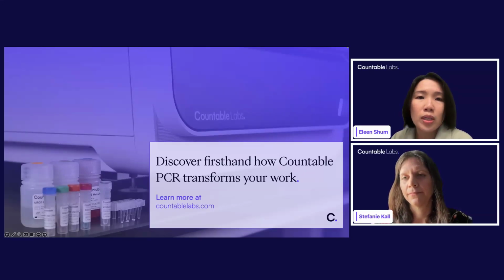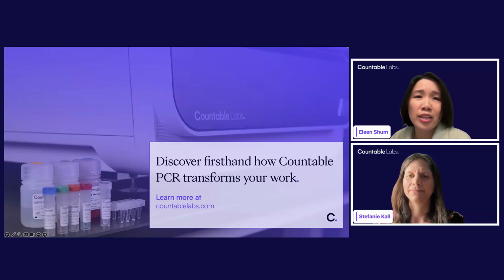Okay, thank you. Maybe this one is for me: there's a question about whether you can use SYBR Green for target detection. The answer is no, we don't support SYBR Green.